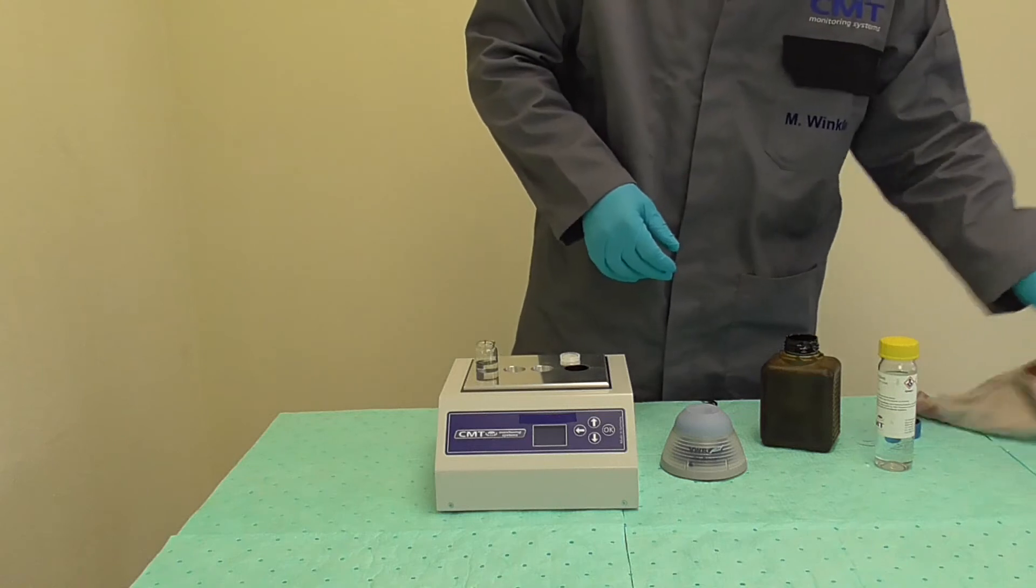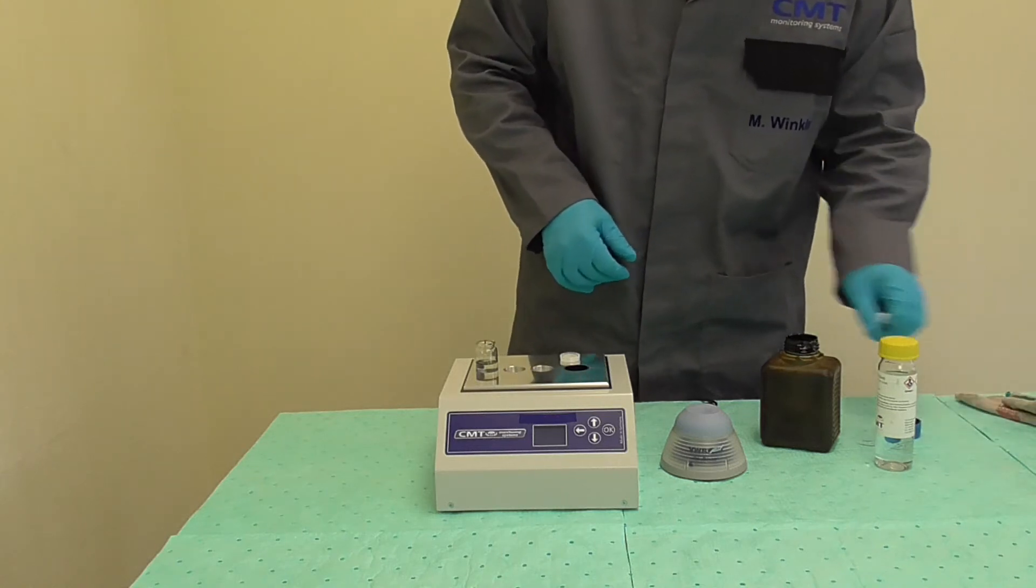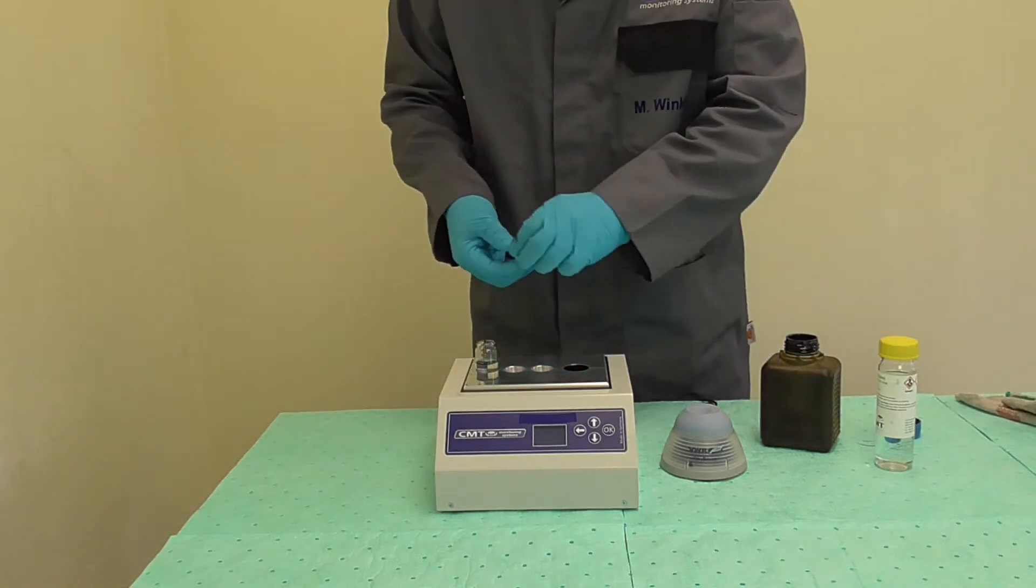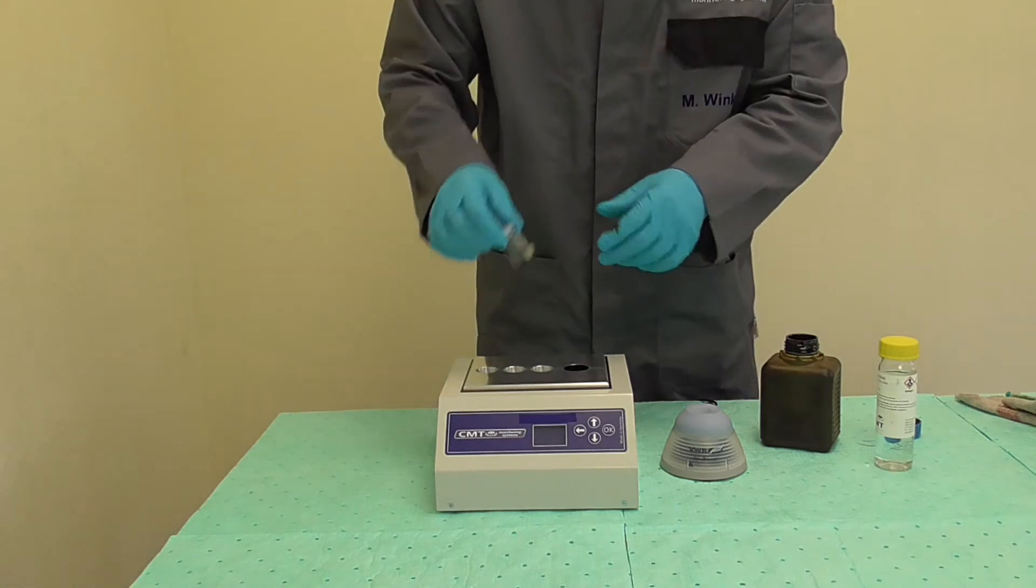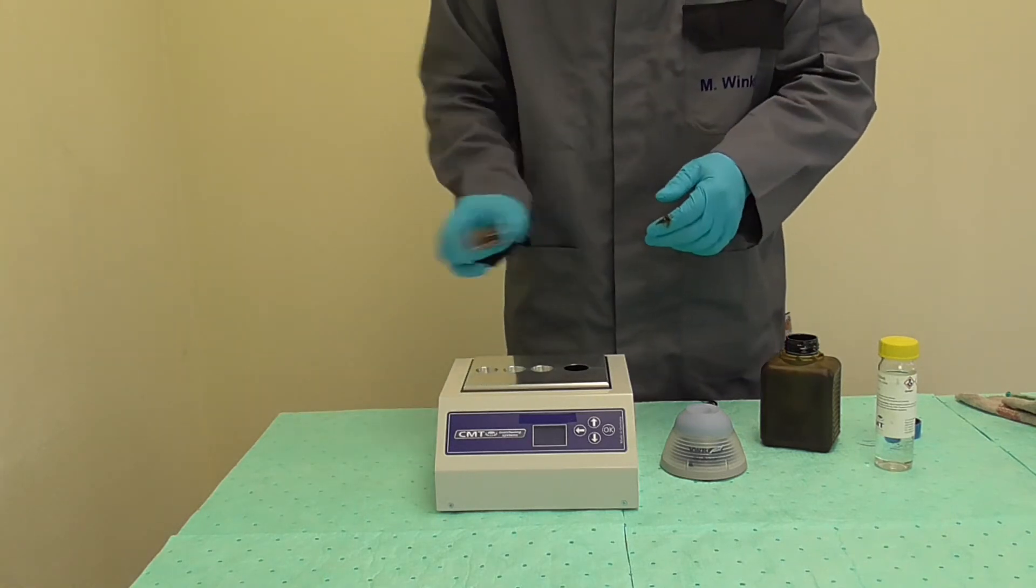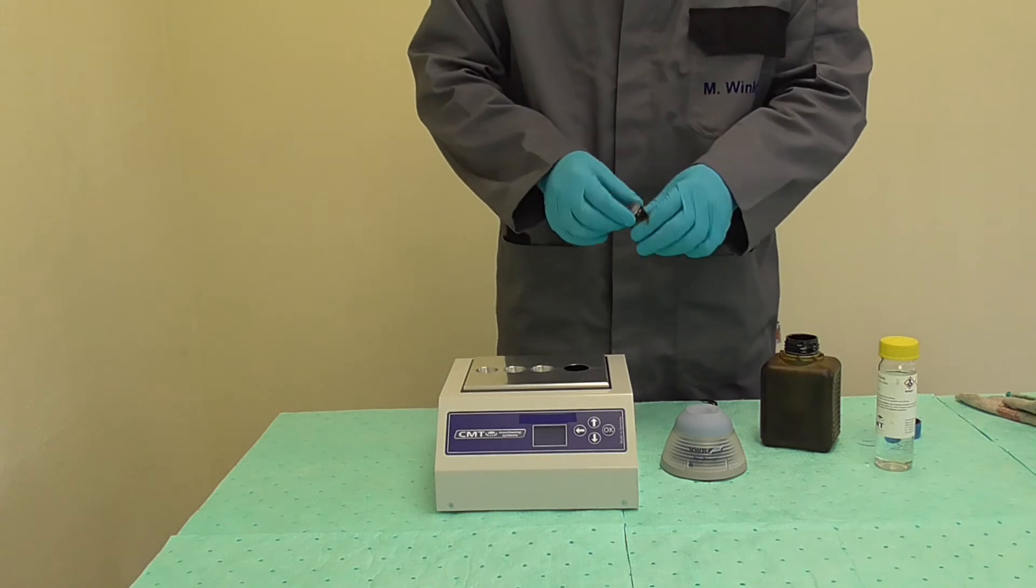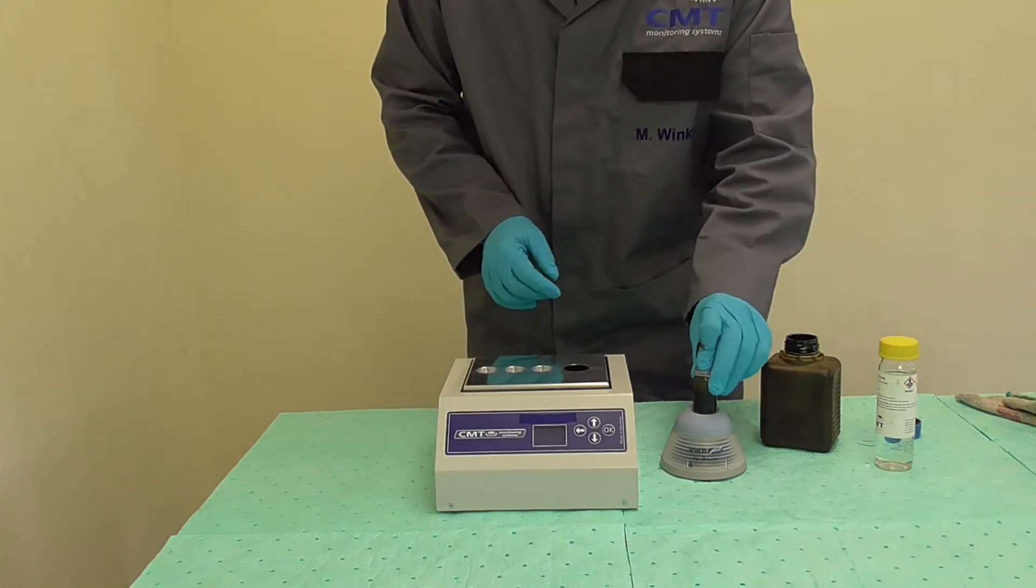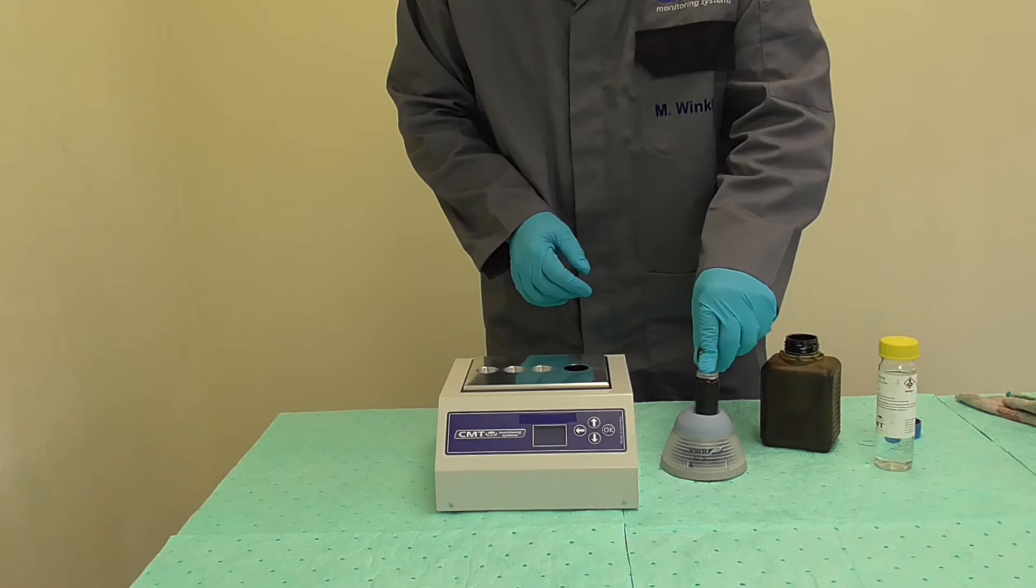Dispose of the one milliliter syringe after use. It can't be used again. Cap the vial and shake it a few times manually. Use the electric shaker to mix the content of the vial for a minimum of one minute.